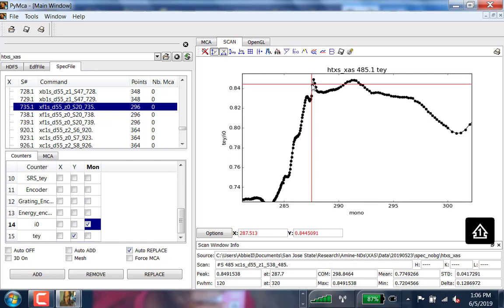Question. So if we're looking, for example, at a carbon scan of boron, where we identify a peak that is associated with a carbon-boron bond, would we see the same or a similar peak on a boron scan in the carbon area? You see what I'm saying? Like, do they correlate back? They should. Okay. They should, yeah.